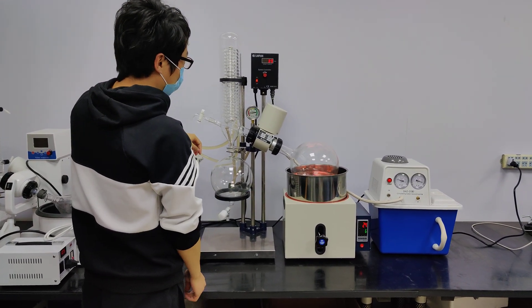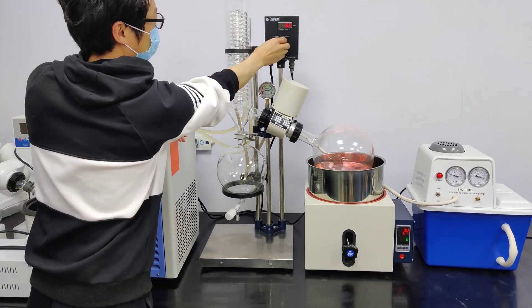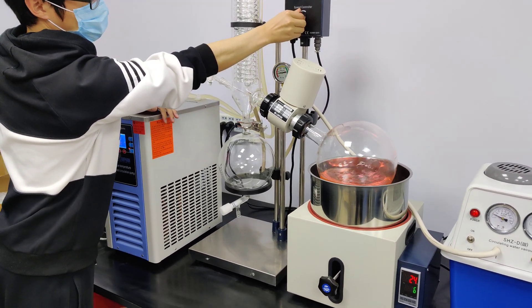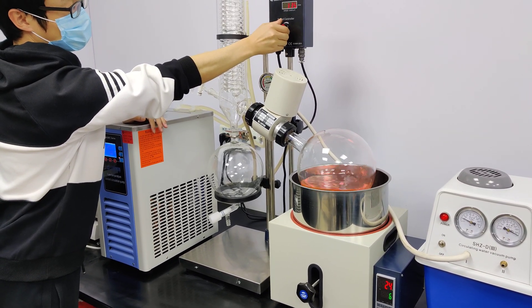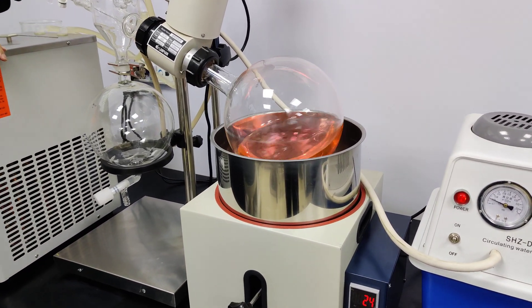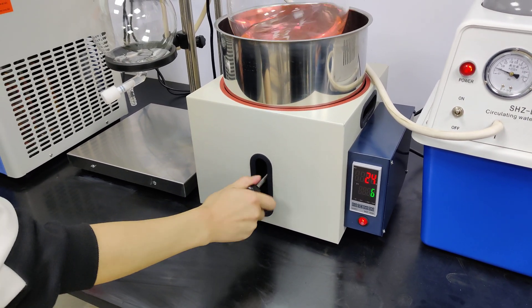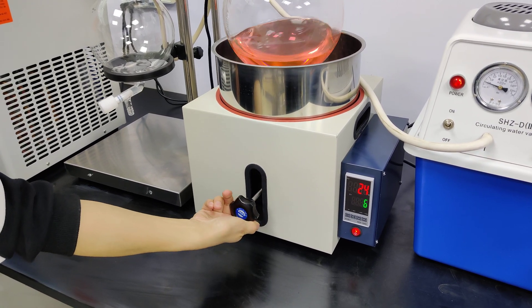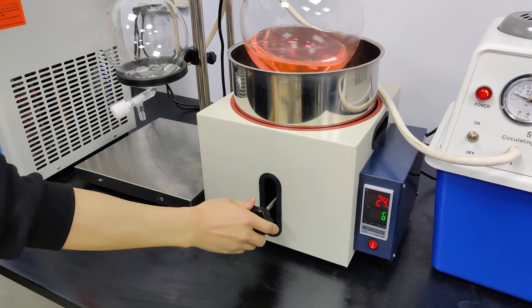Here we can adjust the speed of the rotary flask. And here's the heating box — up and down. Here we go. Thank you.